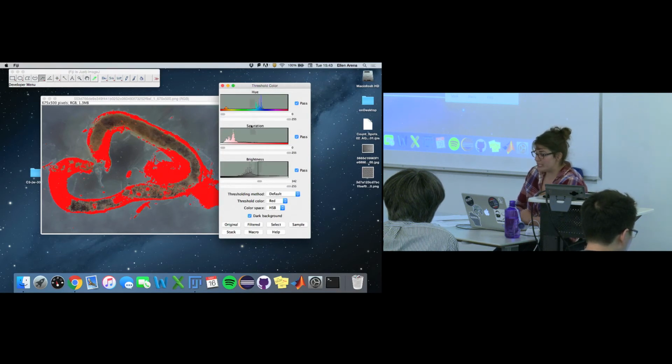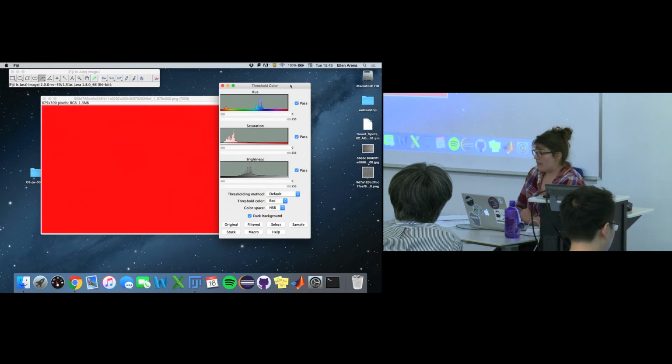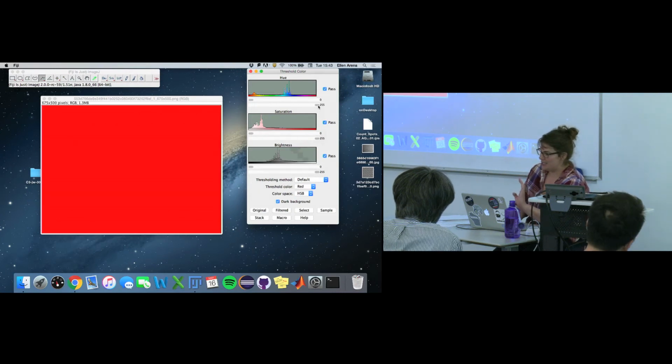So we're going to take all of the brightness and all of the saturation. The saturation should range from 0 to 255, as well as the brightness, 0 to 255. And now we're just going to filter based on color, right? Because presumably they acquired all of the images with the same exact acquisition settings, all the digestive tubes will be the same color.